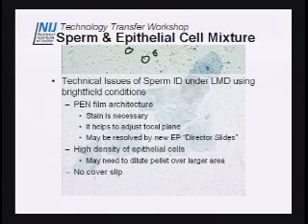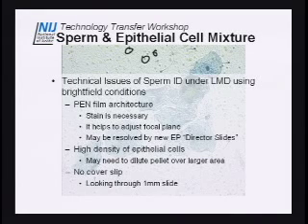And then there are no cover slips. So these are just some obstacles that will be a little different than what you might be used to. Remember, you're looking through the glass, and this is one of those little things that sometimes people forget: there is a correction collar on these microscopes, so you can adjust, and you have to adjust for the 1 millimeter of glass.